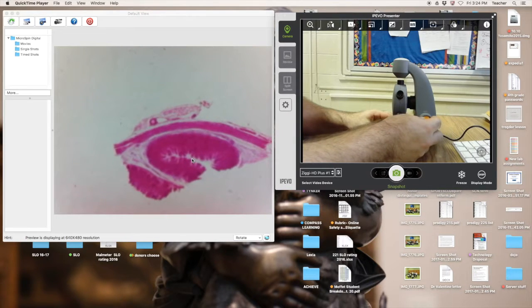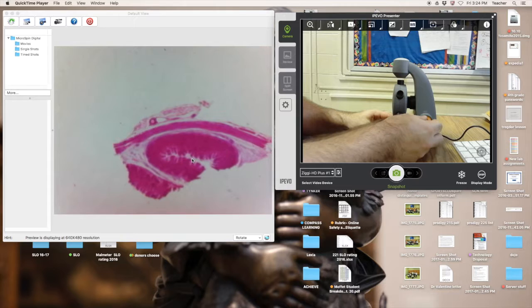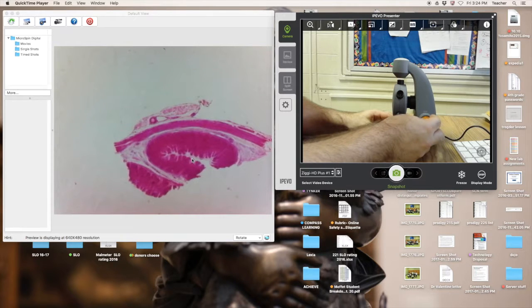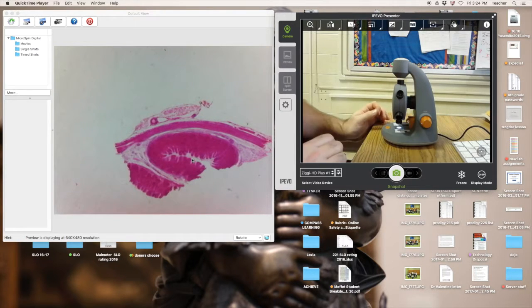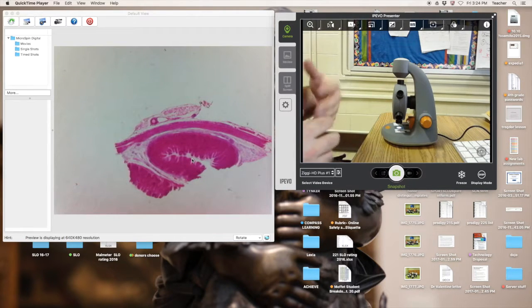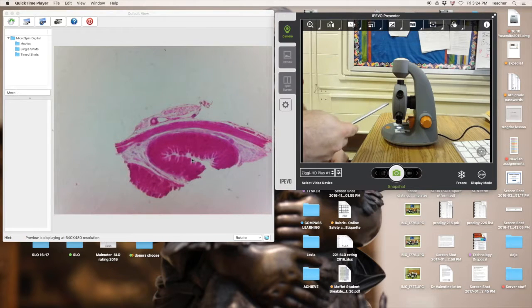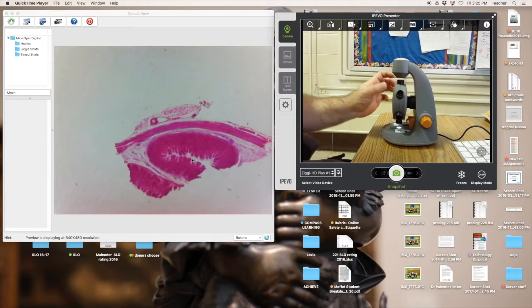When I get a focus that I like, you don't want to go too far. You could always turn back if you need to. Once it's in focus, then we adjust and switch to a new lens like I showed you in the second video, where we spin and go from 10 times zoom to 20.